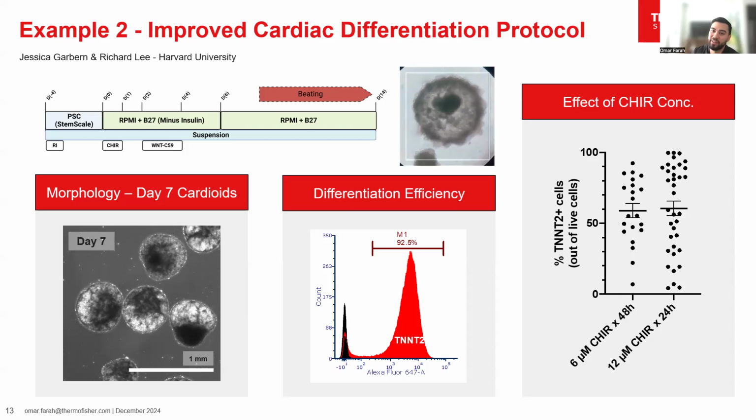I keep saying this, this is not an AI generated image. This is an actual organoid that we took a video of in the lab that looked like a cell with a heart inside. So it was very photo op worthy. As we differentiate these cells, we start to see those spheroids change in morphology.